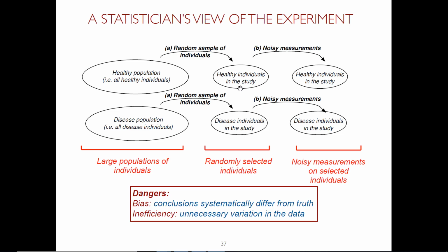And then we take the subjects, but again, the protein abundances in these selected subjects are still unknown. What we actually know is that we take the subjects and profile them using mass spectrometry, so the only thing we actually see is the peak intensities that we collect here. Now we have two layers of variation. One is the biological variation: we have different abundances because we select different subjects. And then we also have the technological variation, because we have some measurement artifacts from that.